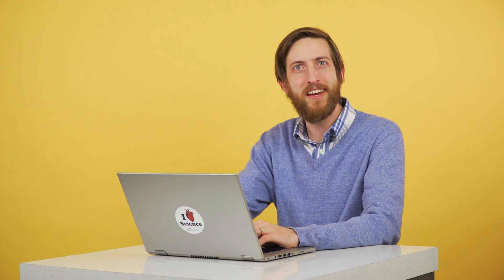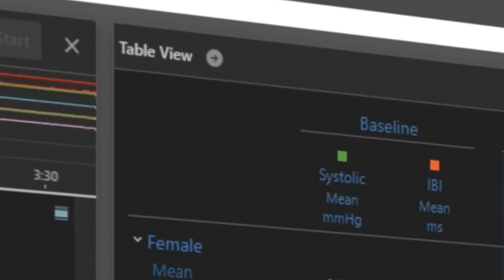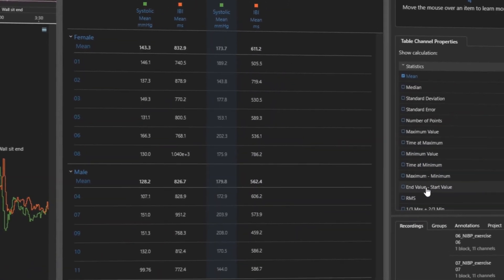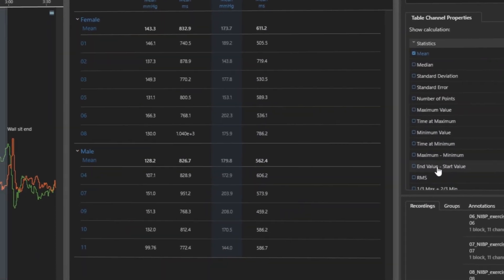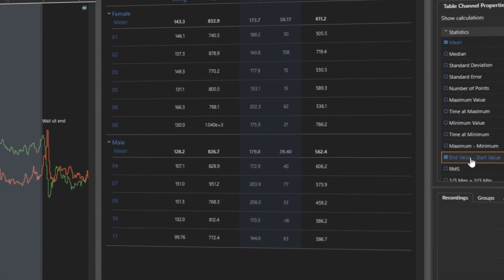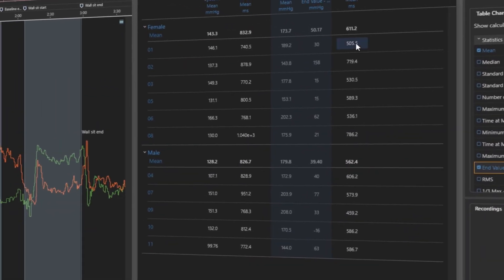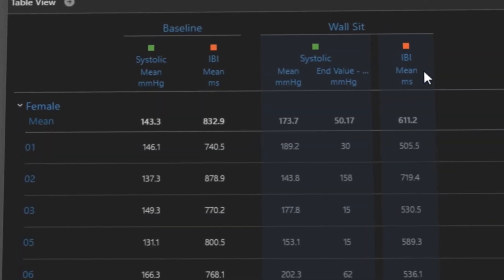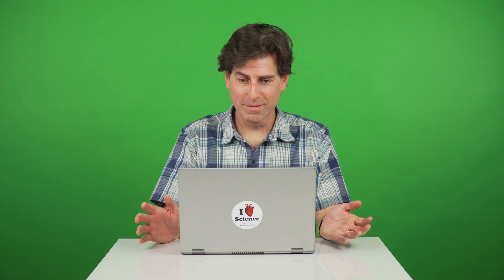The table feature in LabChart Lightning lets you analyze all of your data from different recordings in one place. This means you can do cross-recording analysis without having to export your data. All of your analysis in one place — it's done!